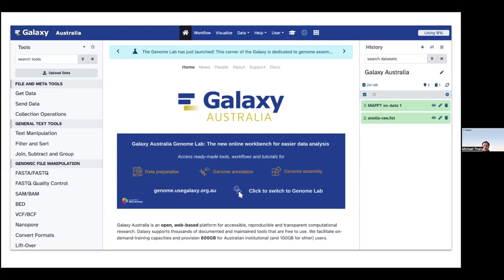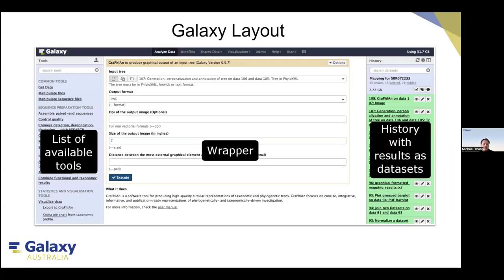Galaxy includes thousands of popular tools for analysis and processing of biological data. If you are a tool developer, wrapping your tool for Galaxy is a great way to make your tool available to the research community. What you see here is the Galaxy panel on the left-hand side, which contains a list of available tools installed on any Galaxy instance. In our case, this tool is available on Galaxy Australia.